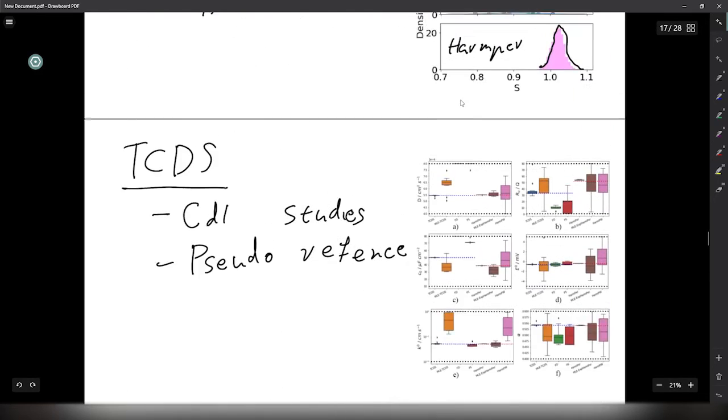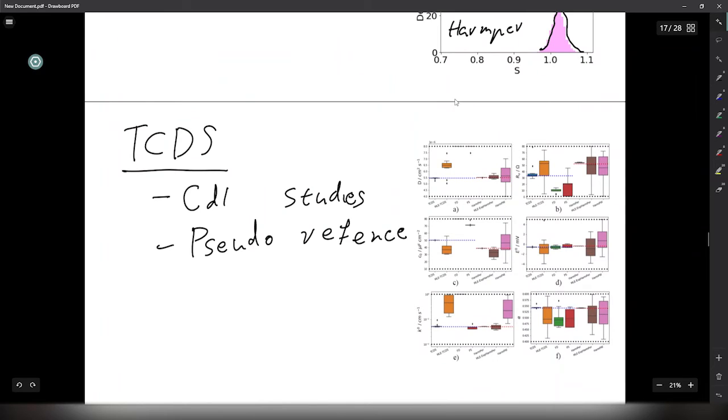Again, the big principle is this is a mathematical technique, but you want it to do chemistry. At the end of the day, we're trying to solve chemistry, so you should, in essence, just use it to solve said chemistry. So any values you get, you need to double check, are these values valid? Because the computer doesn't understand the chemistry, that's our job as researchers to understand. So we need to add that prior information, in essence. The computer will treat it like a mathematical problem and just find the best fit, and that might not be chemically what is the best fit.